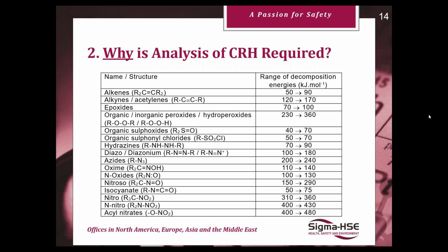Generally, if we see any of these functional groups in materials that we're scoping for clients, we'll advise thermal stability testing. And these literature values can help us hone in on the riskiest parts of a synthesis method.